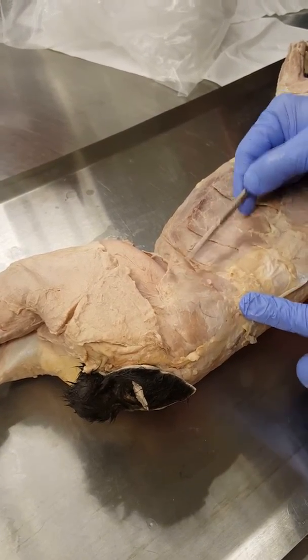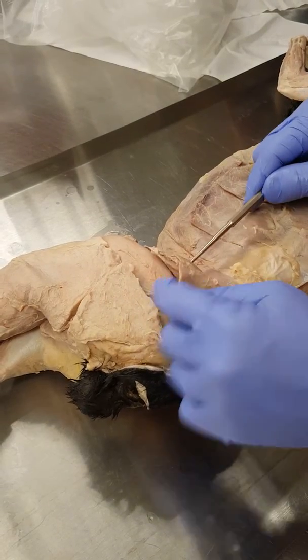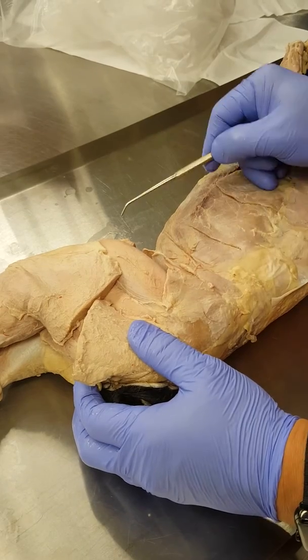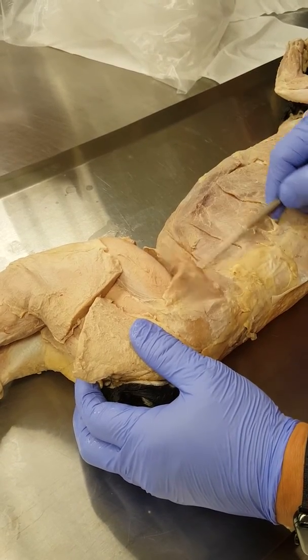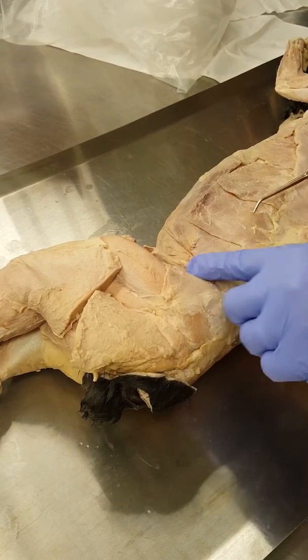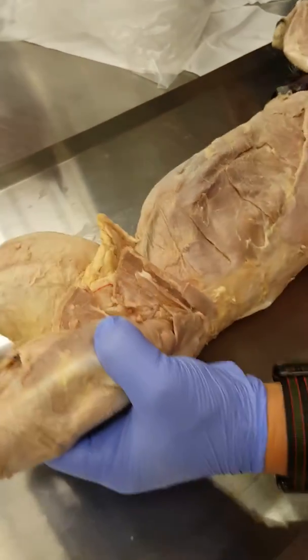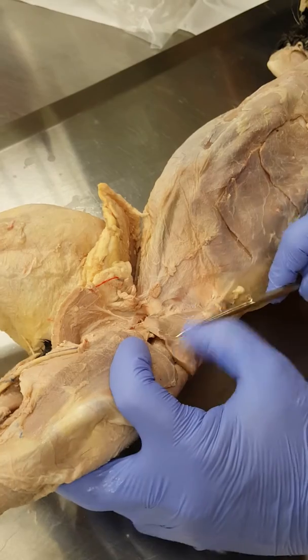You can also see tensor fascia lata, and tensor fascia lata always has a little check mark look to it, right? So it goes down and up like a check. So that's tensor fascia lata. Okay. Now, superficial to that, we're actually seeing your sartorius right here. Okay, so here's the sartorius right here.